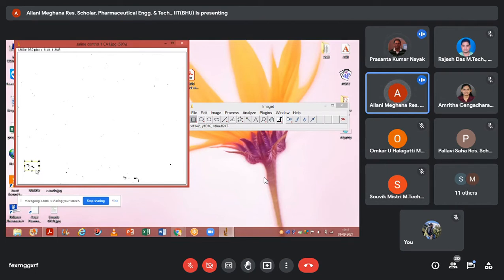Choose a small area using that plus symbol. It will turn into a square box. You can adjust it by putting the cursor over it, rolling over it and clicking, for however much area you want to measure.